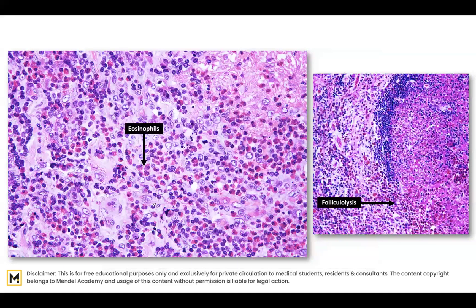You can see plenty of eosinophils here — the typical bilobed nucleus and the bright pink cytoplasm. You can see plenty of them; they are ubiquitous in number.